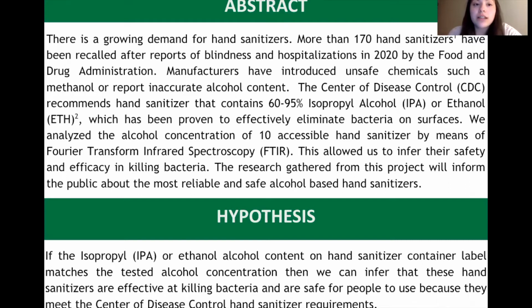Our hypothesis is if the isopropyl alcohol, IPA, or ethanol alcohol content on the hand sanitizer's container label matches the tested alcohol concentration, then we can infer that they are safe and effective at killing bacteria. Now here's Jocelyn with our objectives.